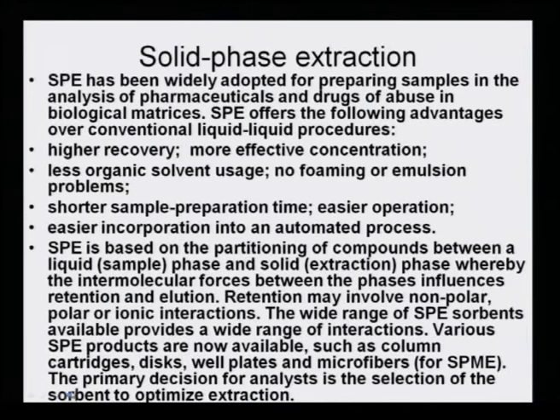A wide range of SPE sorbents available provides a wide range of interactions. Various SPE products are now available, such as column cartridges, discs, well plates, and microfibers for SPME, that is, solid phase microextraction.